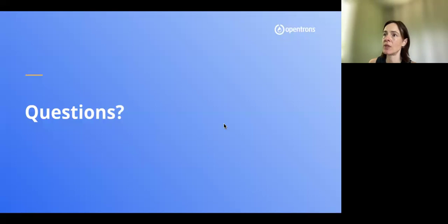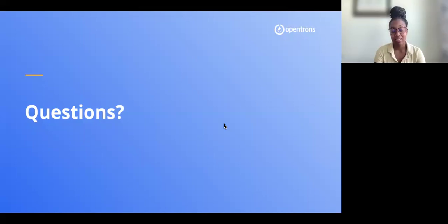So the question is, if we don't see the protocol that we want on the list that you just shared, Kinnari, or in the protocol library, how can we request protocols from Opentrons? Yes. I think the easiest option is requesting an FAS consultation. You can reach out to us at opentrons.com, take a look at the components and get familiar, and then request via our contact there.